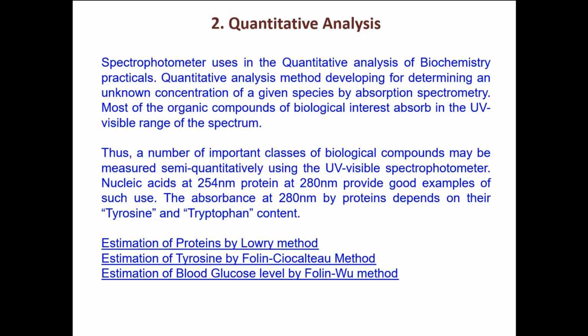When we have a direct reaction, and any one of the product or substrate molecules has a characteristic absorption, we can characterize it. But for a reaction which doesn't have any characteristic absorption at the UV or visible region, I also want to characterize it. I want to see the enzymatic activity of this reaction also.